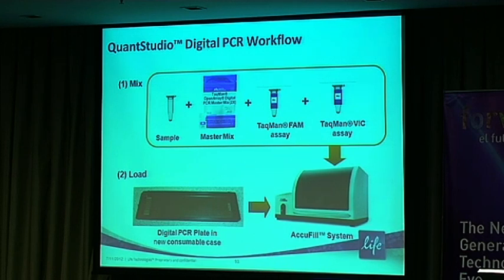Because if you didn't use a control along with the target you're trying to interrogate, you could easily get a false negative assumption, right? You could look at the results and say, oh, I have no HIV copies present in the sample. Well, how do you know there was none there? It could be that you just didn't add anything to those wells, right? So you use a control to guarantee that we have sample introduced, because that's exhibited by the copy counts of our control gene. That's the approach we recommend, using a two-target approach, so the machine can count both. You just mix all this together.